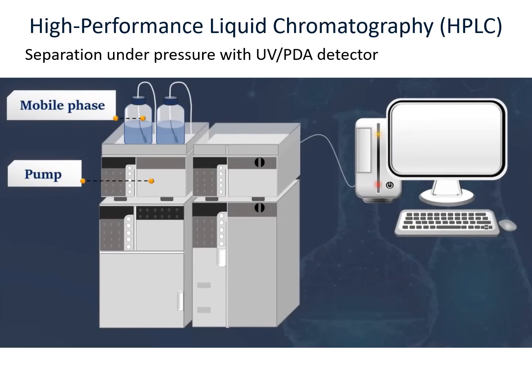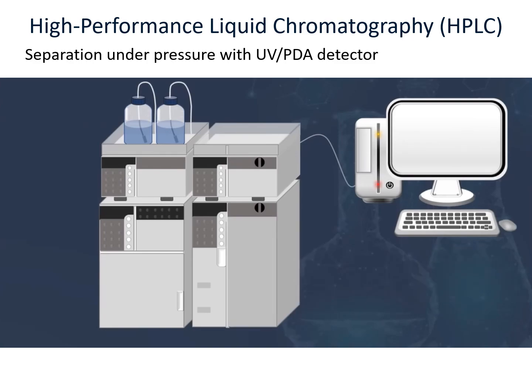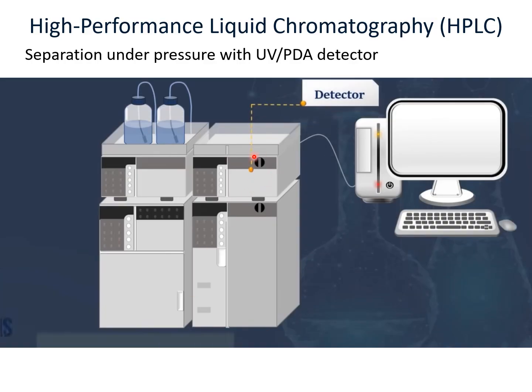Now, this particular system has an auto sampler through which the samples are applied, and then it also has a detector that detects the samples. So there are compartments.